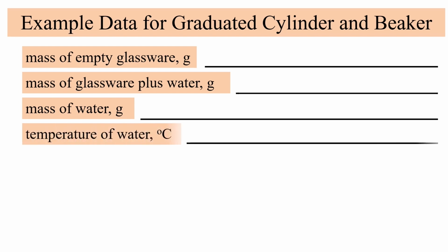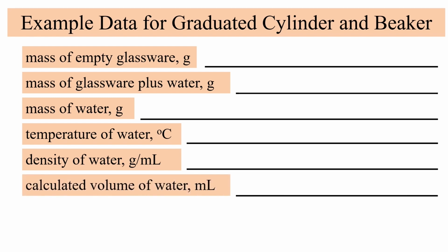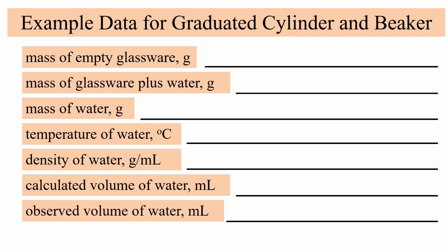Next, we'll measure the temperature of the water. This is necessary because we can use the standard table of densities to obtain the density of water at this specific temperature. As we saw earlier, we can use this density to find the calculated volume of water. And make sure you also record the observed volume.